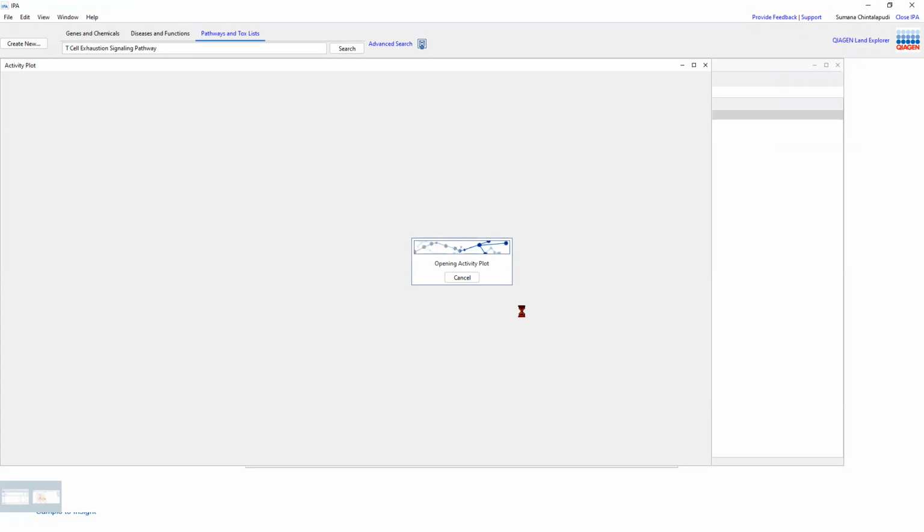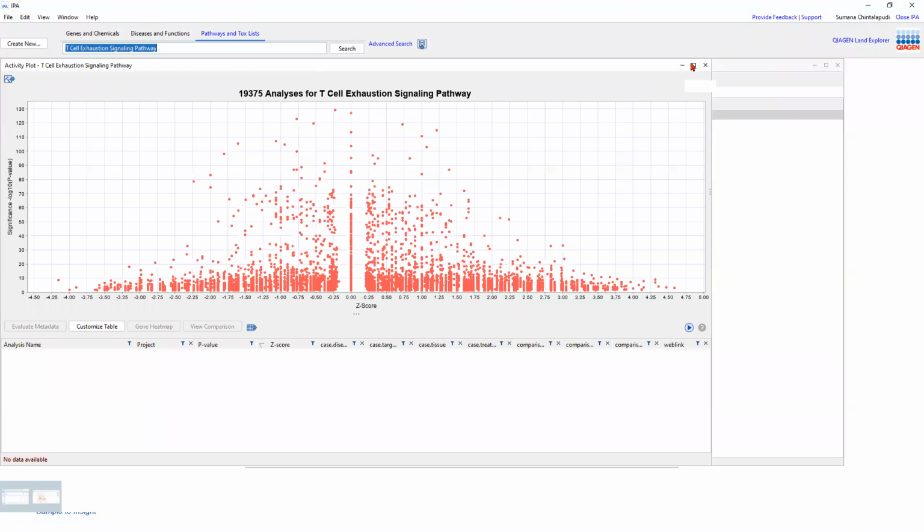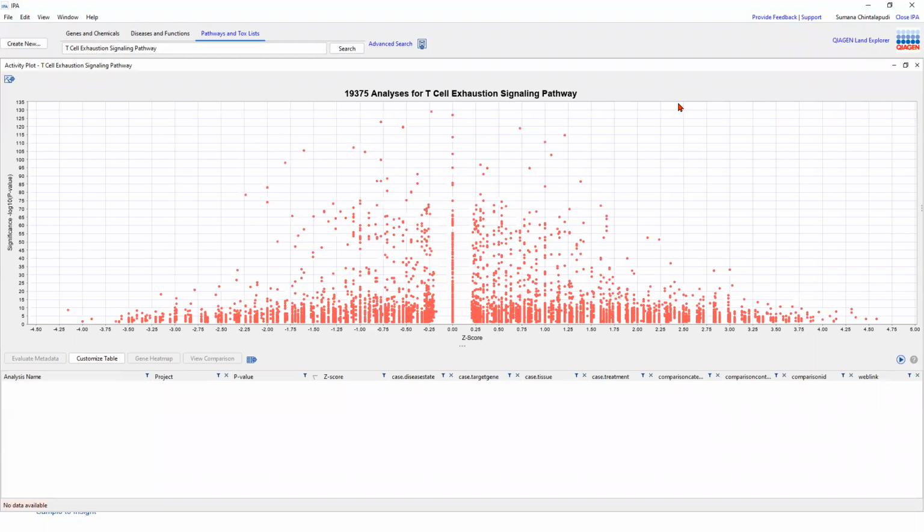So by the way, this is a very popular feature. A lot of biotech people and a lot of pharma companies like to utilize this feature for their research, for doing drug discovery and all.